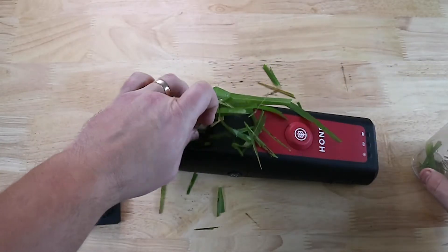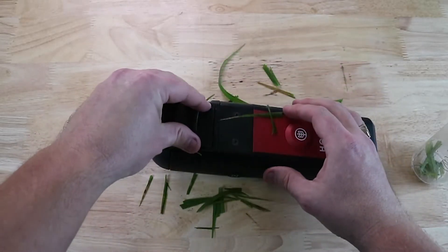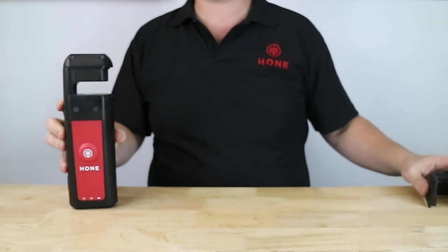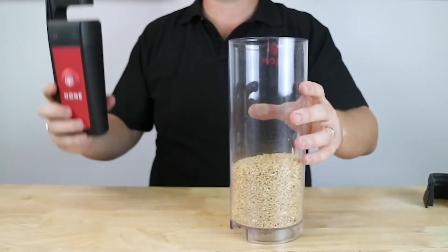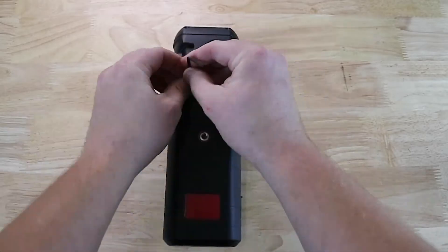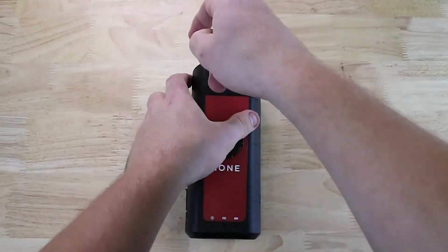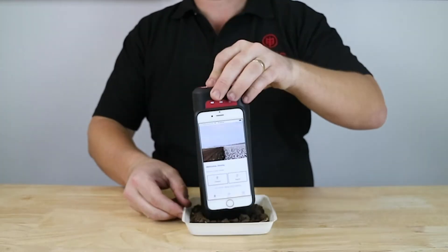For this reason, we can actually measure using Hone Lab in a few different ways. You can fill the sample chamber, which is great if you're measuring pasture or plant tissue for nutrients. You can also remove the sample chamber to submerge the head of the Hone Lab, which is easy if you want to test some grain. You can also remove the top section of the Hone Lab to test with certain sample types, measuring in reflectance — so you can easily test soil with the base unit, for example.